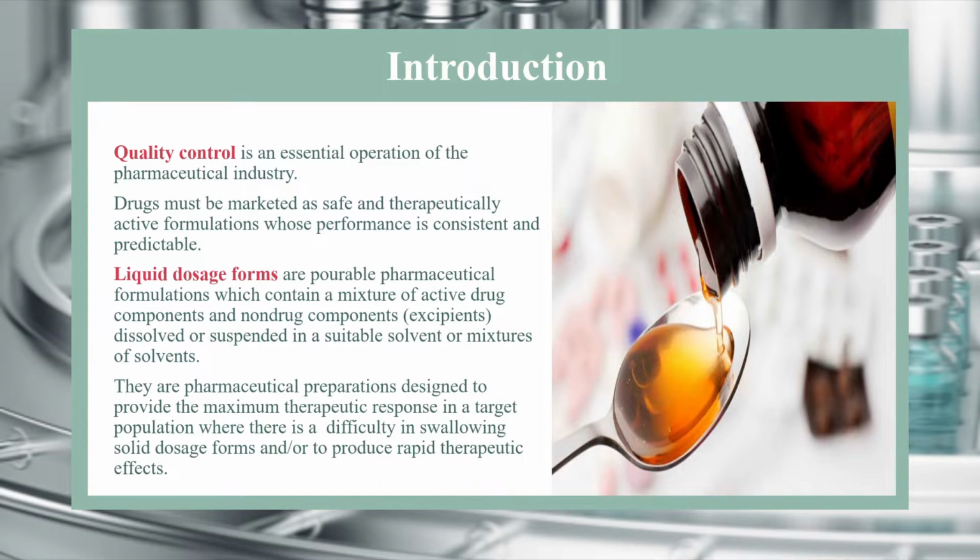Quality control is an essential operation of the pharmaceutical industry. Drugs must be marketed as safe and therapeutically active formulations whose performance is consistent and predictable. Liquid dosage forms are pourable pharmaceutical formulations which contain a mixture of active drug components and non-drug components as excipients, dissolved or suspended in a suitable solvent or mixtures of solvents. They are pharmaceutical preparations designed to provide the maximum therapeutic response in a target population where there is a difficulty in swallowing solid dosage forms and/or to produce rapid therapeutic effect.